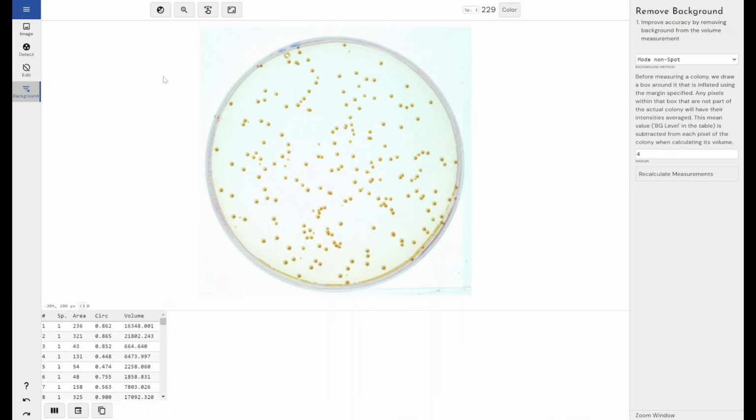And that would be a full analysis essentially. Now I've obviously sped through this for the benefit of the viewer. It wouldn't be very exciting for a viewer to watch me fine-tune the minutiae of this. But if you wanted to export the results, you can export that in the form of a PDF report from the software directly, or you can export it in terms of CSV or copy this measurements table, including whichever of these options you've turned on, to your clipboard and then paste that into another piece of software, MATLAB, SPSS, Excel, wherever you want it to go. You can just copy and paste it nice and easily.